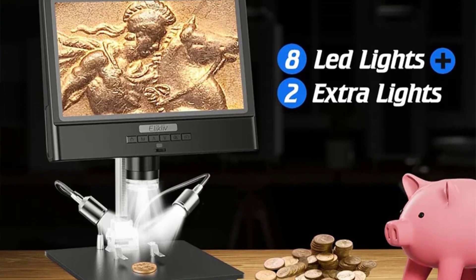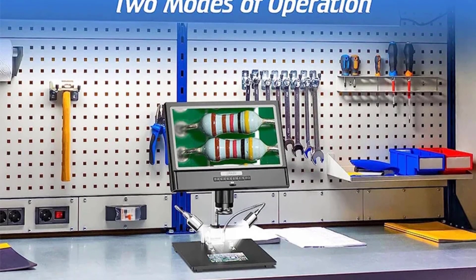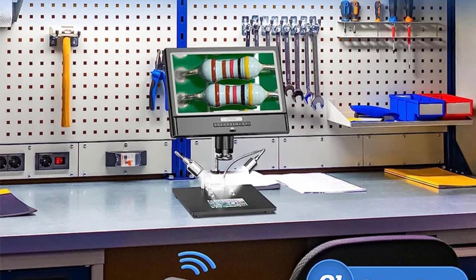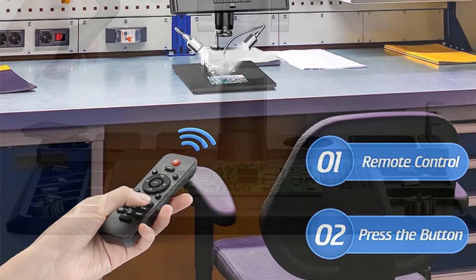The inclusion of a wireless remote control adds a layer of convenience to the user experience. This feature allows users to control the microscope without disturbing their work, making it easier to capture images or adjust settings effortlessly.